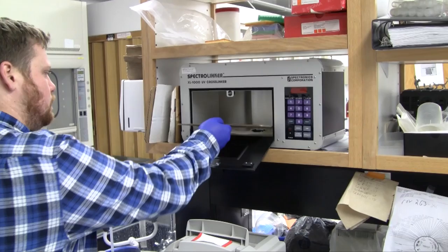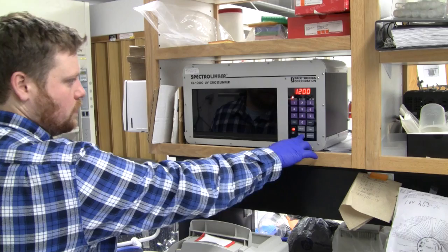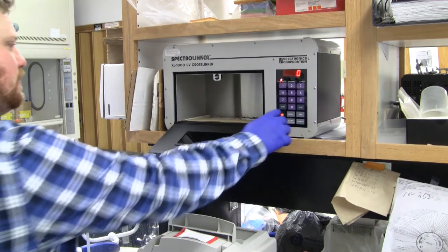Slides can be stored for a few days at room temperature or at 4 degrees Celsius, although same-day hybridization is recommended for localization of small targets.